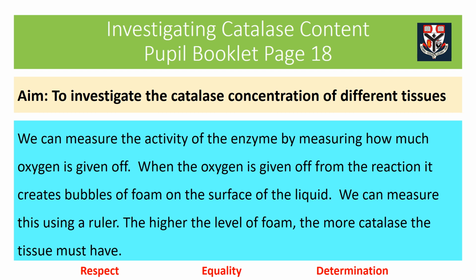The tissues that you will use in class, for example, liver, potato, carrot or celery, contain catalase. When they react with hydrogen peroxide, oxygen will be produced.